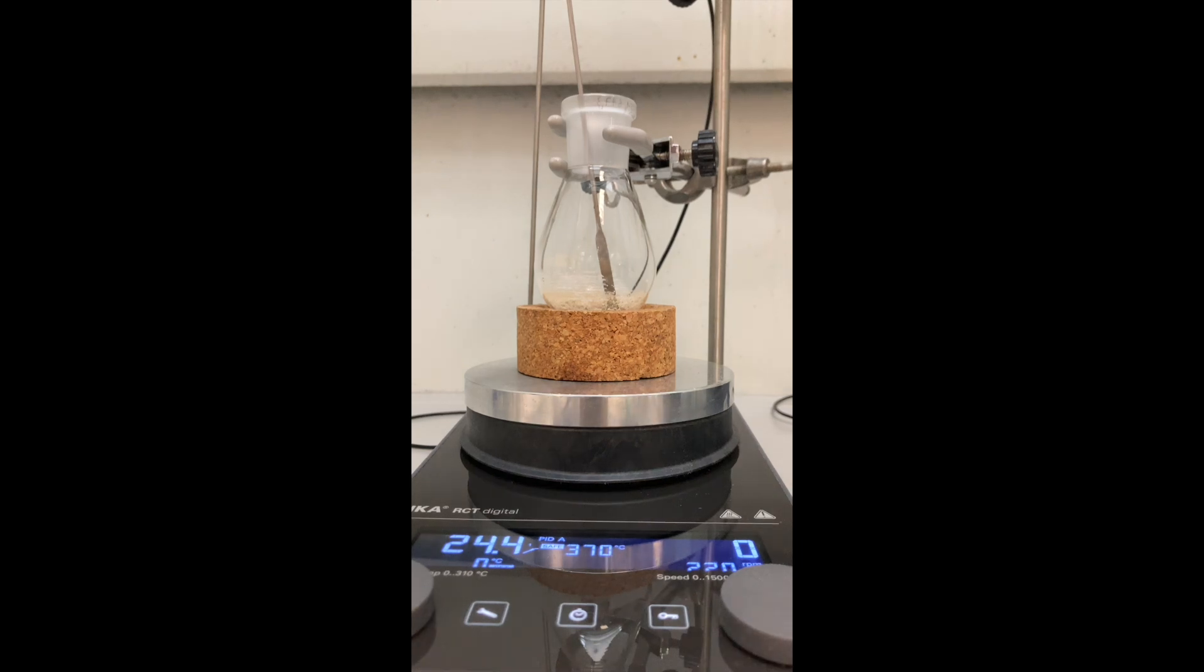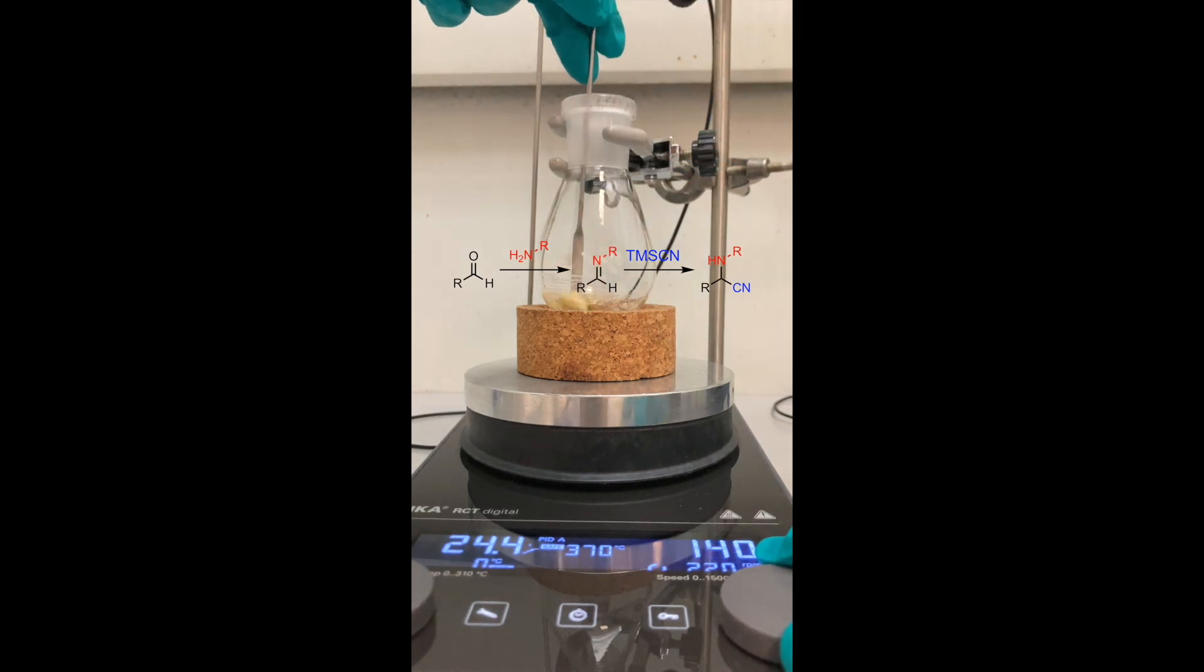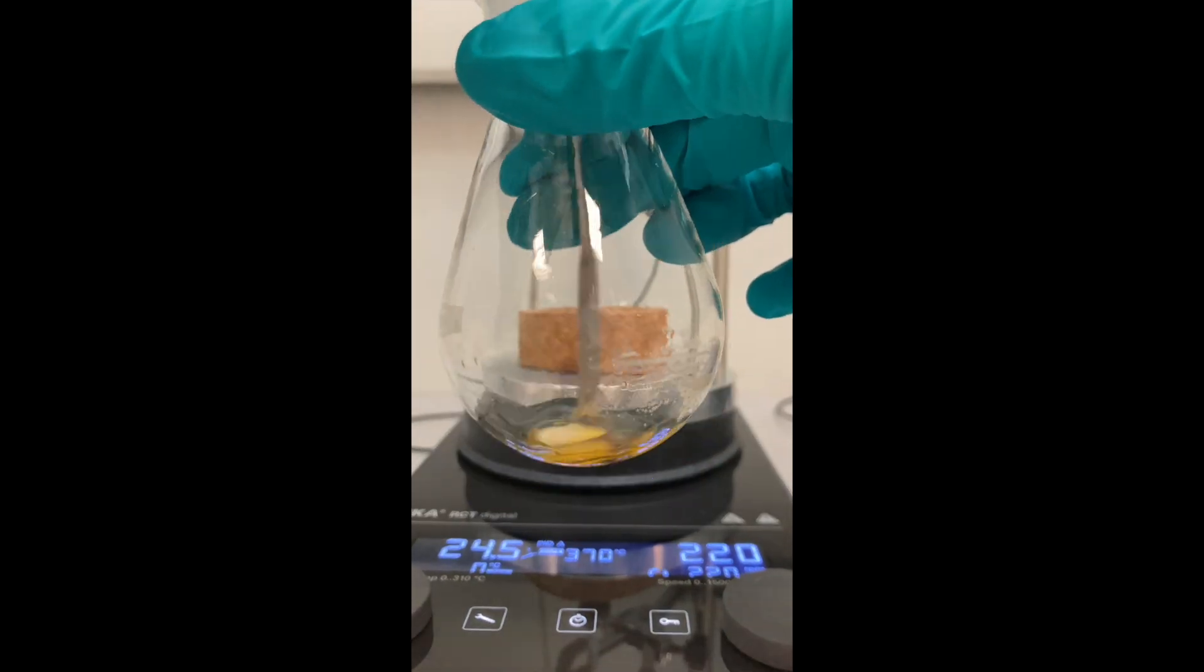I set up a Strecker reaction. The Strecker reaction is the condensation of an aldehyde or a ketone with an amine in the presence of a source of cyanide anions to afford the corresponding alpha-aminonitrile.